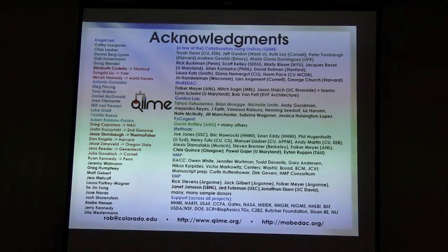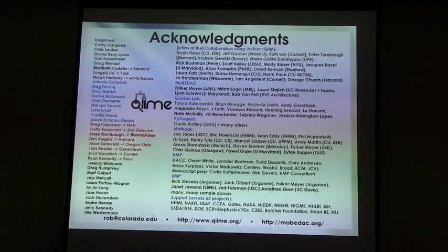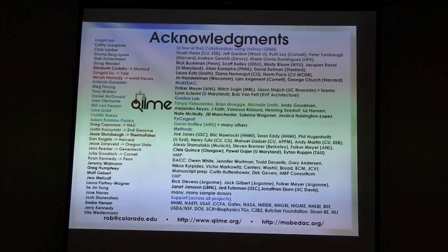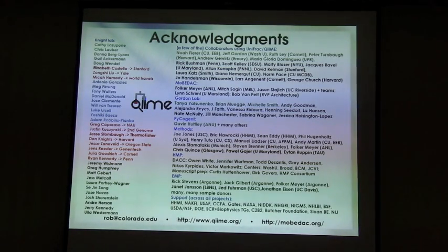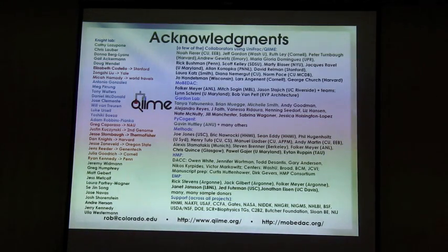I'd like to thank the large number of people currently and formerly in my lab who've worked on both the data sets that I've shown you and especially on QIIME itself. What you can download off GitHub as of Monday, we recently moved it from SourceForge, is exactly the same as the version that we use in the lab.